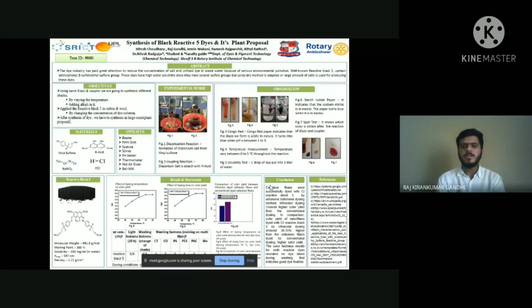Thank you, Hitesh. I am going to explain the methodology. First, start with diazotization. Vinyl sulfone is charged to the MSRL reaction vessel along with water and ice to maintain temperature between 0 to 5 degrees Celsius. Then hydrochloric acid will be added, followed by sodium nitrite gradually till the diazotization is complete, which can be confirmed by starch iodide paper. Any excess nitrite will be removed by adding sulfamic acid just before coupling. Keep temperature between 0 to 5 degrees Celsius throughout the diazotization reaction.